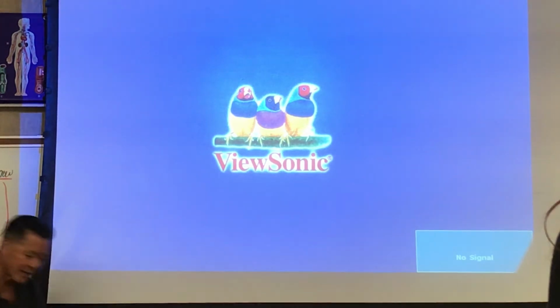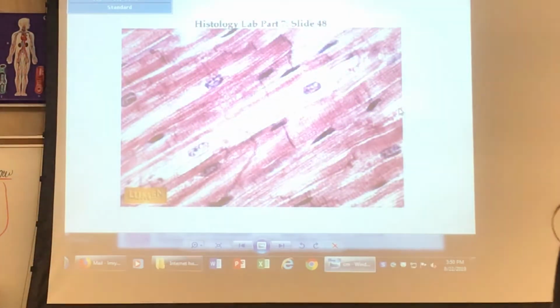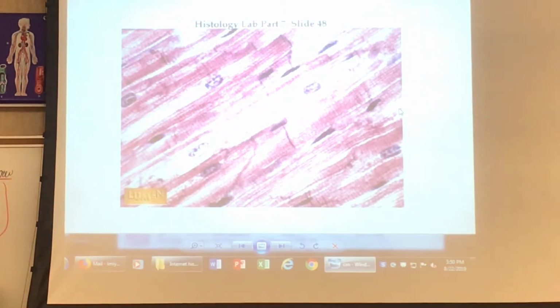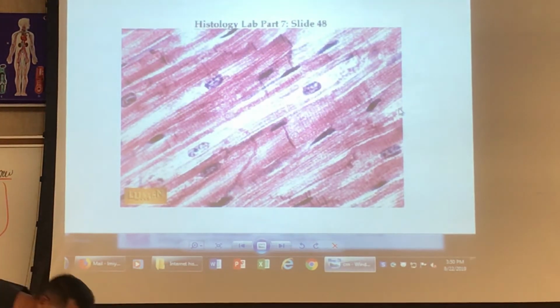Do you see a basement membrane and a free surface? No. Are these cells separated by stuff or are these stacked tubes? Confused. Do you see some striations? Yes. But what else do you see? Intercalated discs. What is this? Cardiac muscle.